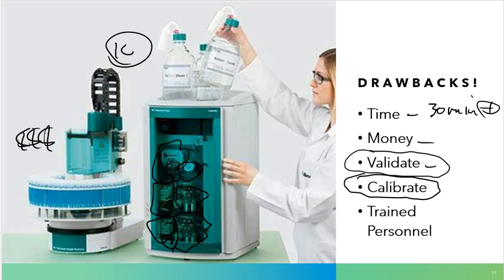And then finally, the other drawback with the instrumentation courses of 191 is simply trained people. Not everyone can go into the lab and just automatically know how to use some of this instrumentation. So very often it requires training. That training is going to be SOPs. That training has to be done by professional people. You have to prove that you're using the machine the right way before you're cleared on using it.